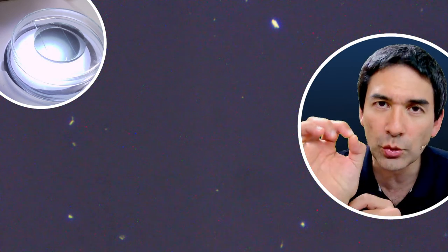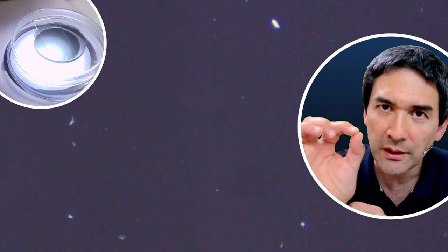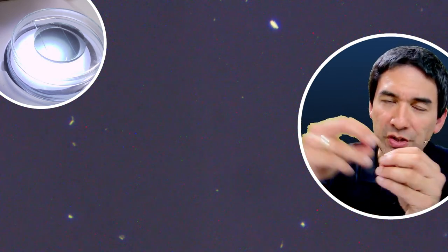Intertwined. You mean the crystals? Okay, yes, I get it now. The question is why are the crystals intertwined? Essentially, what happens is that there is a so-called crystallization start, where the first molecules start to arrange with each other, and from there they start growing in one direction. If somewhere else another crystal is growing in a different direction, then it will cross it. They will cross each other.